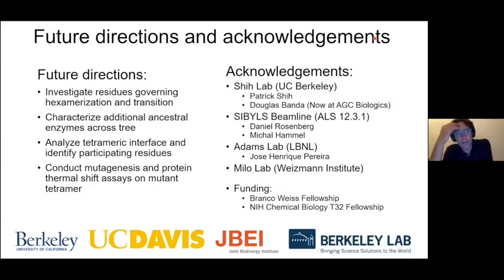Thank you, Albert. I just have a short question before we move on. In case you have the identification of different oligomeric states, you mentioned you want to do some mutational study to distinguish which residues are really required for the interface of the specific tetramer, especially since it's something new. And that is how it's going to be important in carbon sequestration. Do you think you're going to continue that with carbon sequestration assays, or do you want to do that SAXS with carbon sequestration? I mean, in the biological aspects, what do you want to do? This is just simple oligomerization state determination with SAXS, but can you imagine some kind of bioassay with the SAXS?